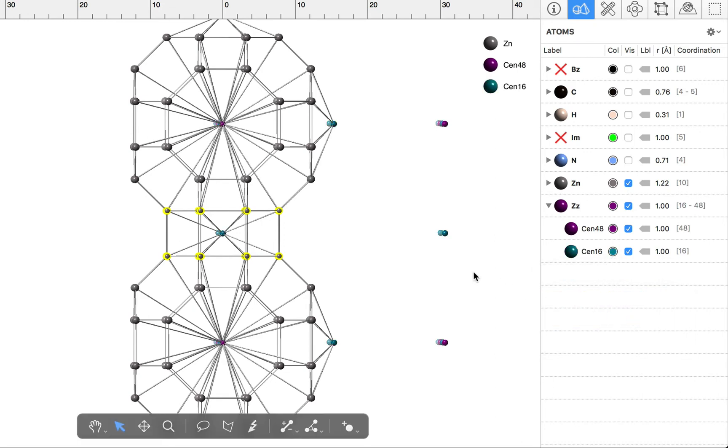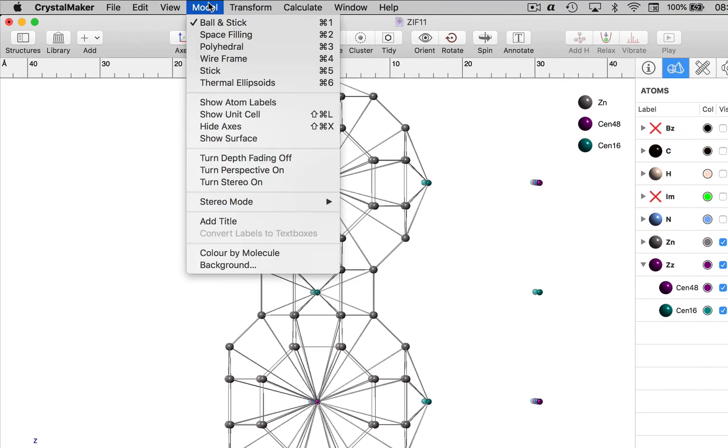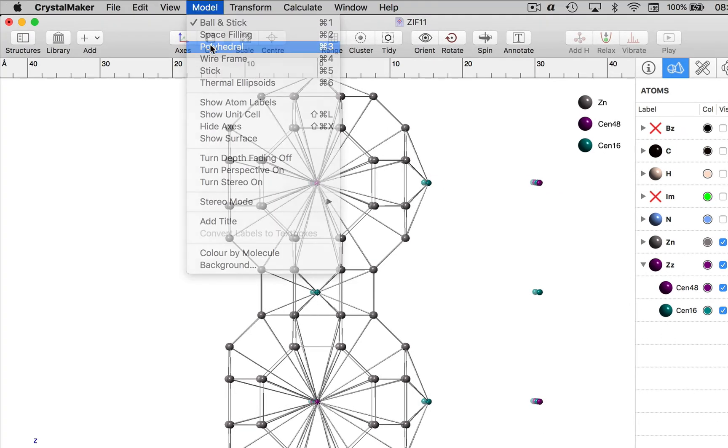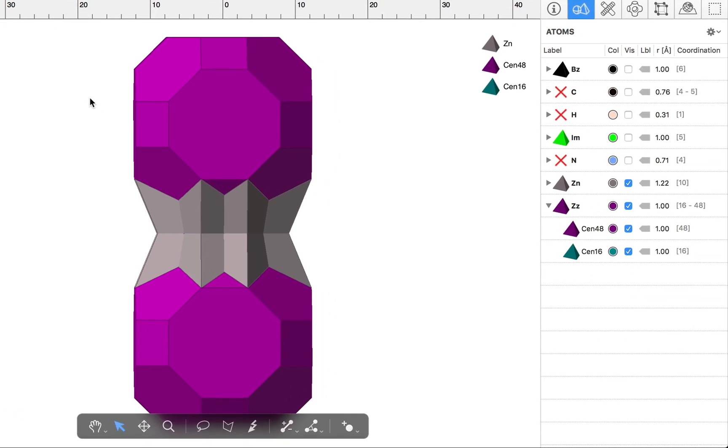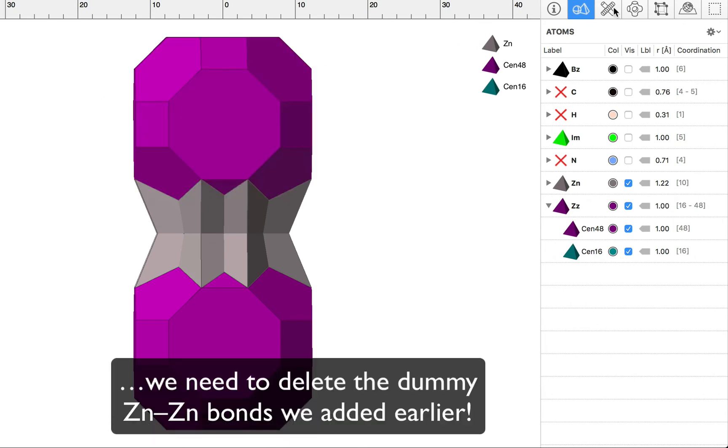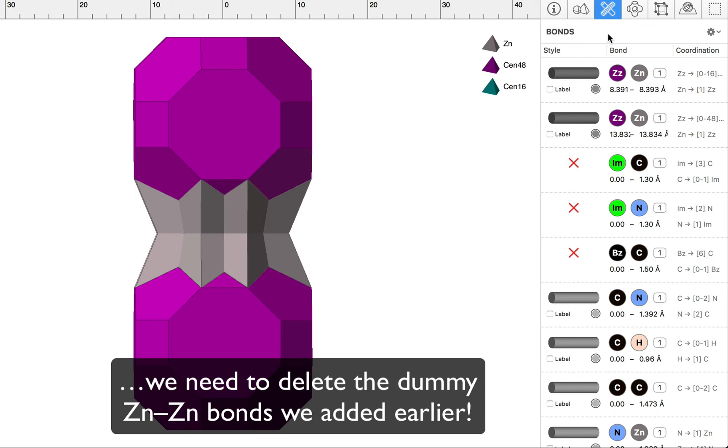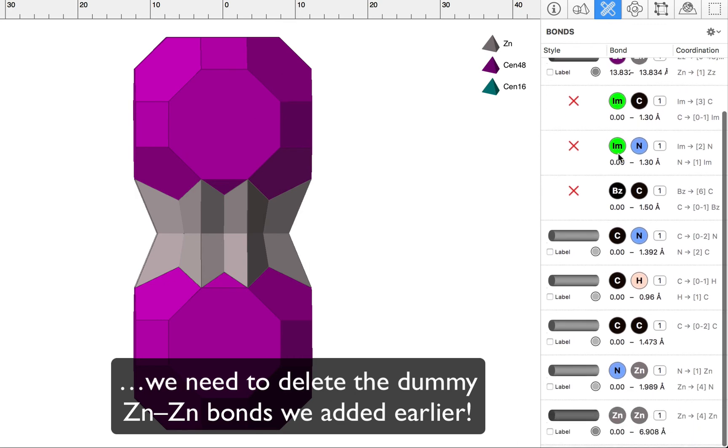And now we can go to a polyhedron model, and we have got some polyhedra. Now we have to be a bit careful here. We've still got those dummy bonds between the zinc atoms. So I'll go to the bonds inspector, and we need to delete the zinc-zinc bonds that we added at the start.